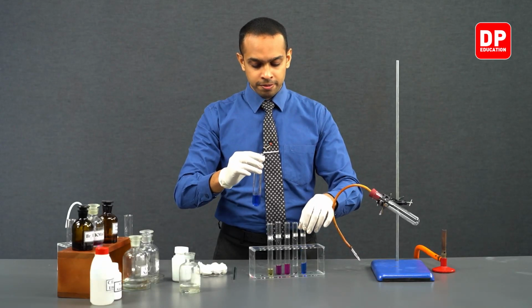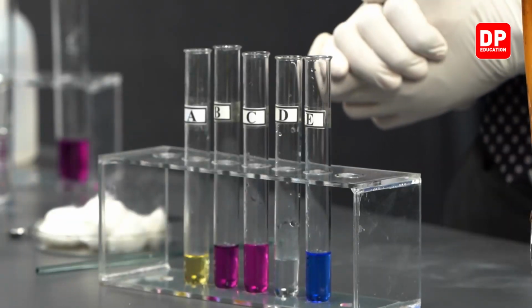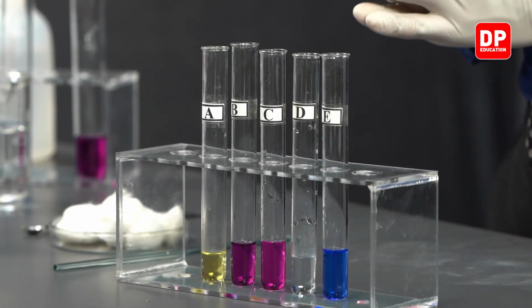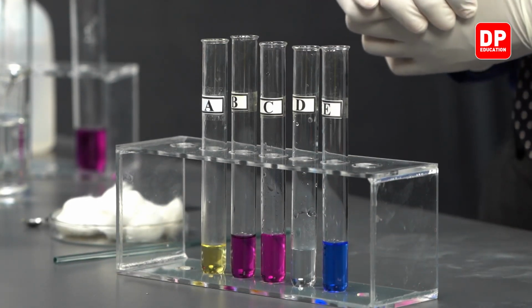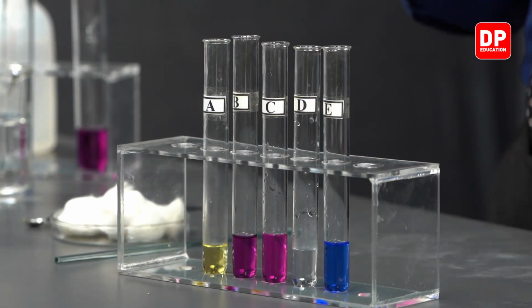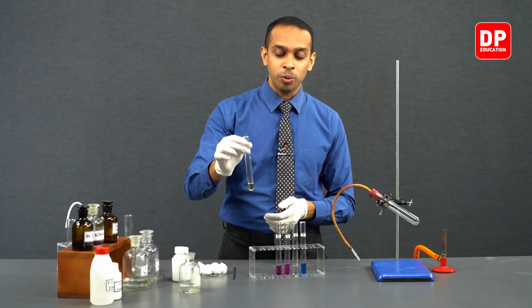We have in our test tube E ammoniacal cuprous chloride. So before we start producing ethene, let's go over what we have in each of these labeled test tubes. In test tube labeled A, we have bromine water, which is yellow in color.